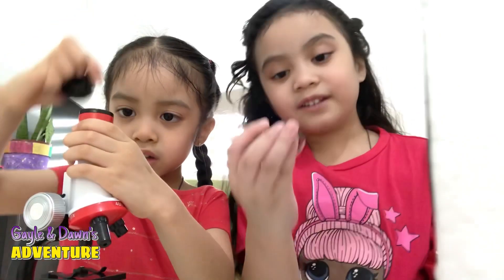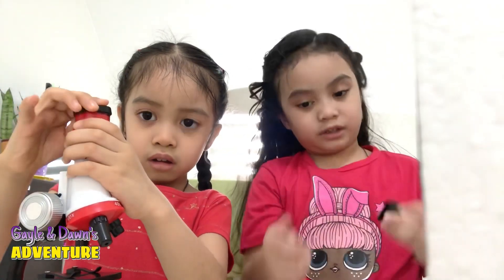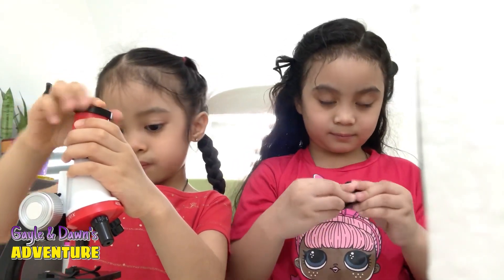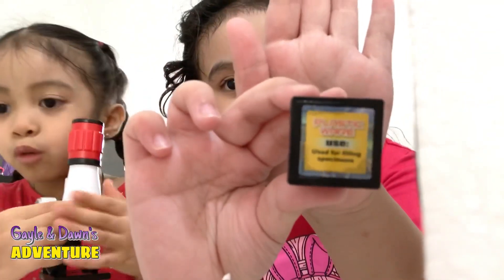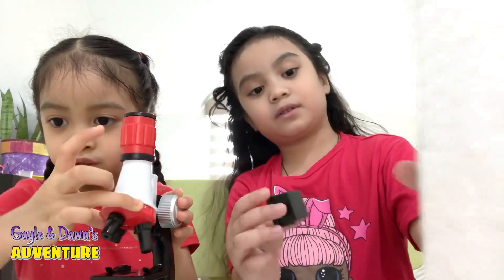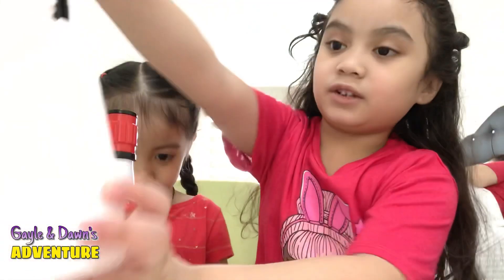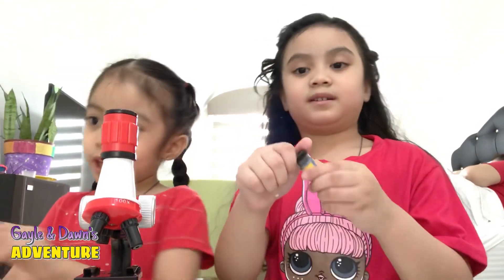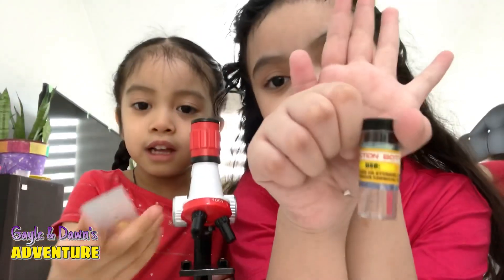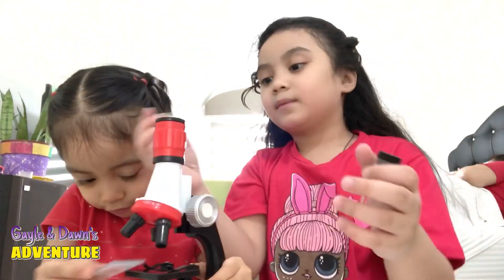There's a bottle compartment — I think that's where... wait, what? I think there's like things inside. This thing you can move. It can move, yeah, it has a different smell. And this can move too, and this. And there's wires. This — oh my god, this is my ABB card. I'm going to try it off and open it. Whoa, they look like they're the same.